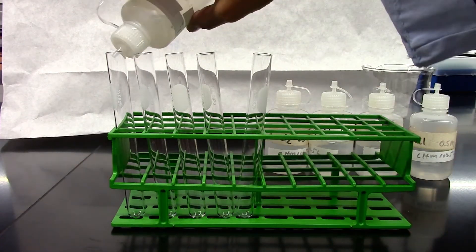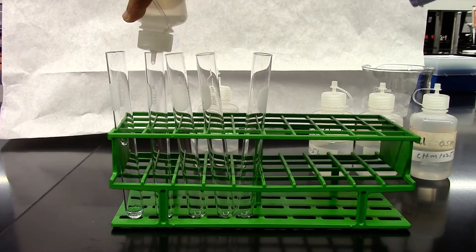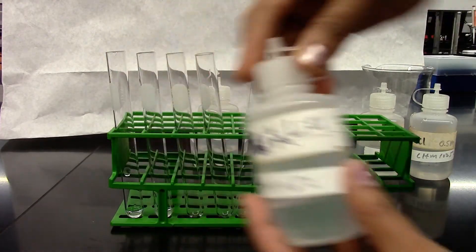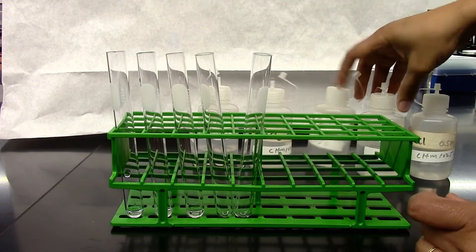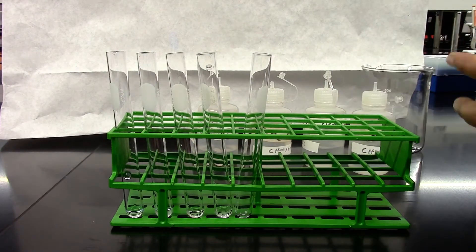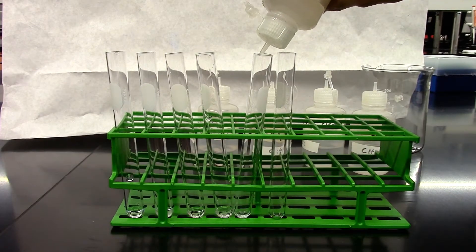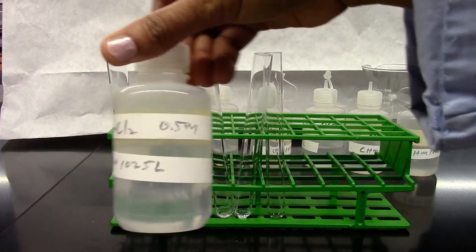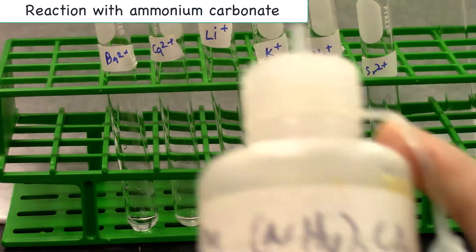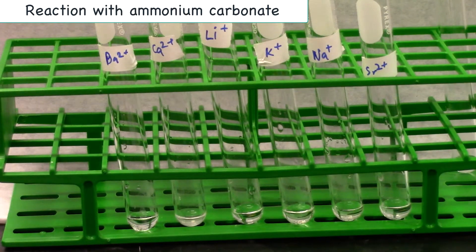The first one is barium chloride. Next is calcium chloride. The third one is lithium chloride. The fourth one is potassium chloride. The fifth one is sodium chloride. And the sixth one is strontium chloride. To each of these test tubes I'm going to add a few drops of ammonium carbonate and look for our observation of precipitate or no reaction.